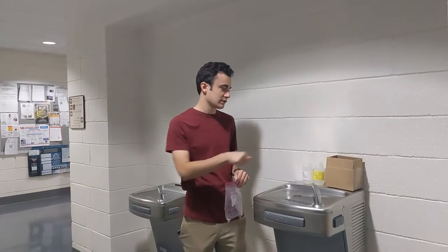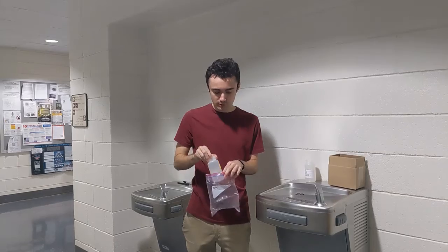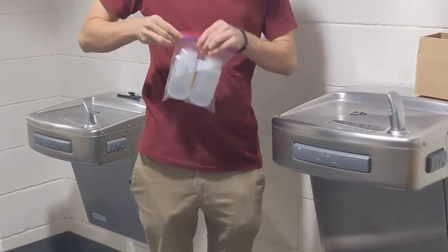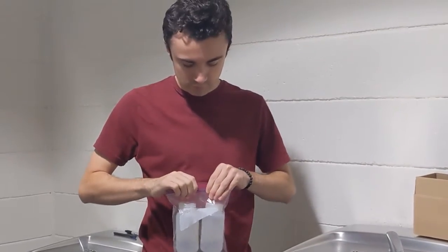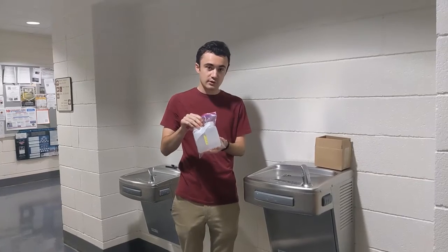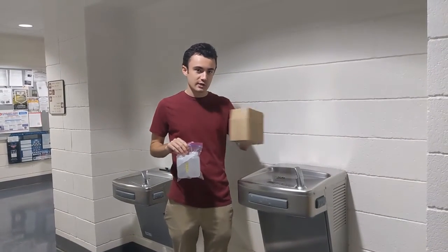And now that you've completed the sample, you'll put the bottles with filled out labels back into the Ziploc bag and seal the Ziploc bag. Now you can put the bag containing the two bottles back into the box in which they came.